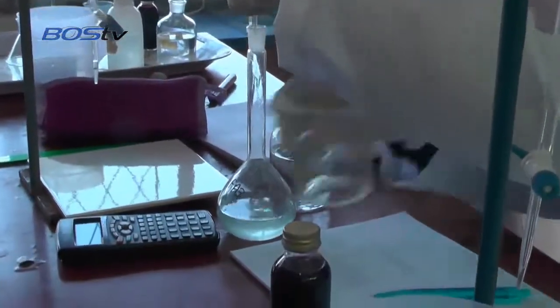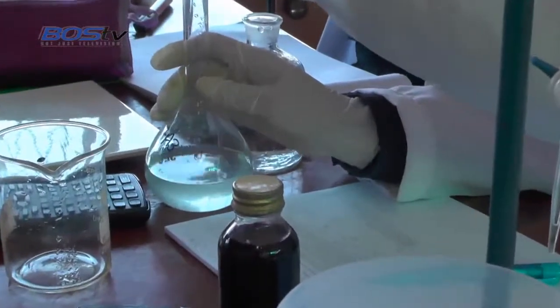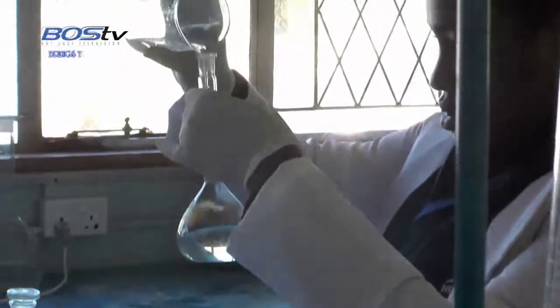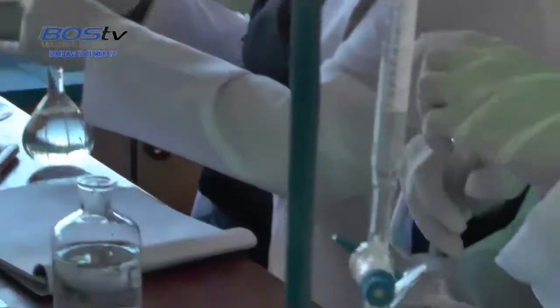Make sure the volume of water you measure using a measuring cylinder. Don't use a beaker. Use a measuring cylinder provided. Measure your FX first.